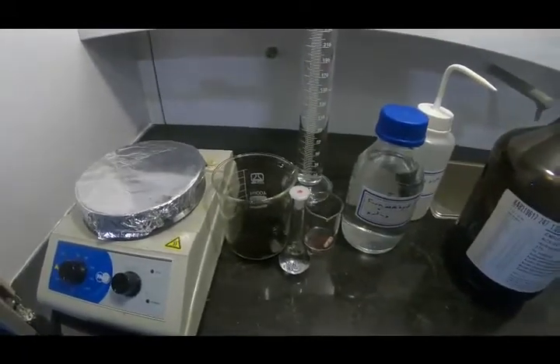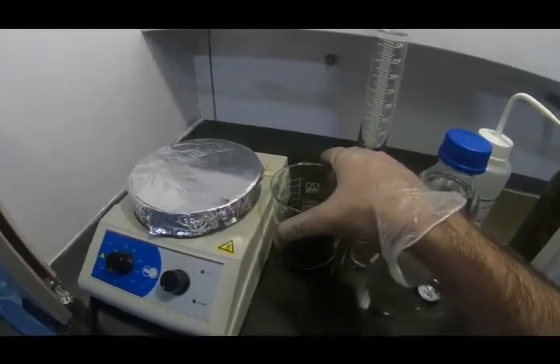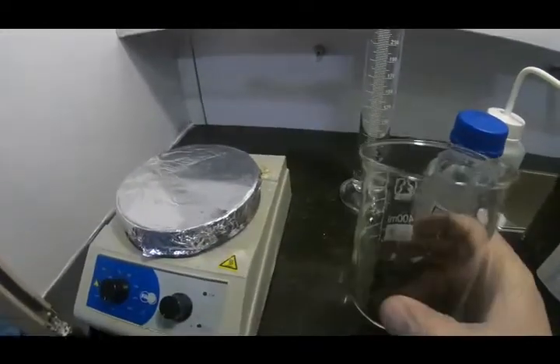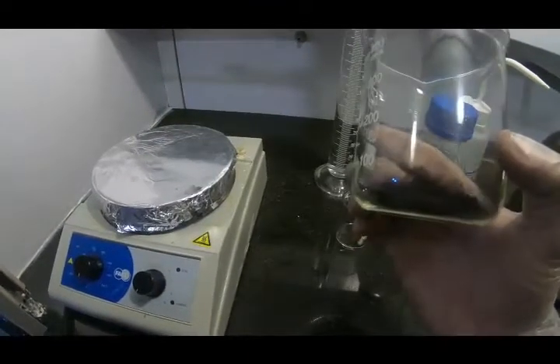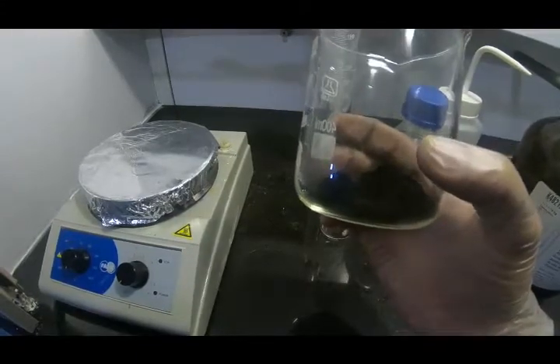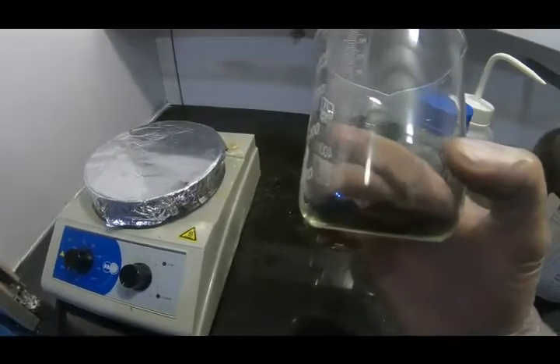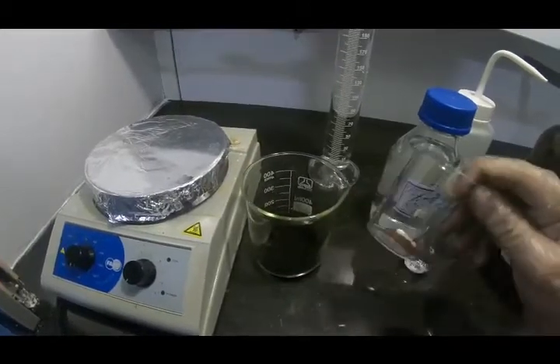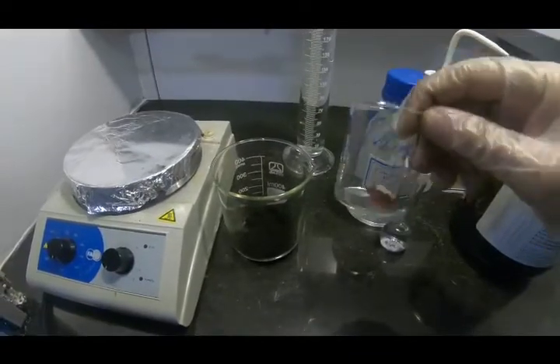Okay, we are going to prepare some palladium on carbon, 5%. In order to prepare 10 grams of the palladium on the carbon, you need to weigh out about 9.3 grams of acid washed carbon. You can wash any source of carbon with 10% nitric acid. Then you need some palladium chloride, around 820 milligrams of it.